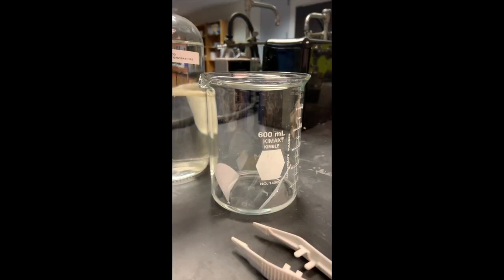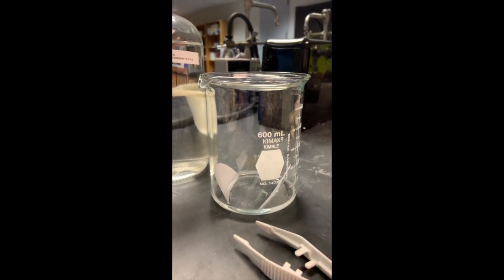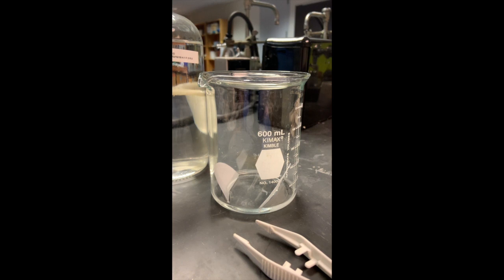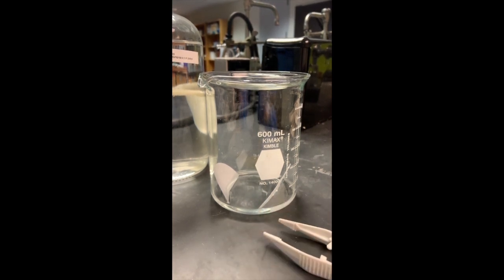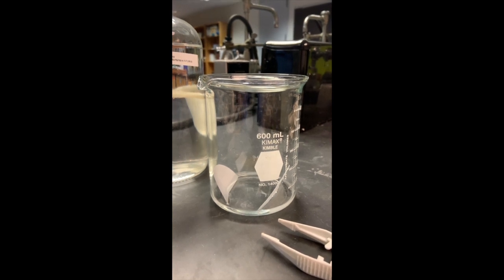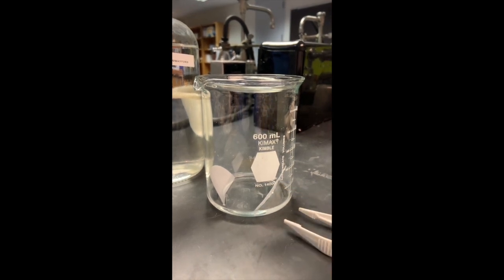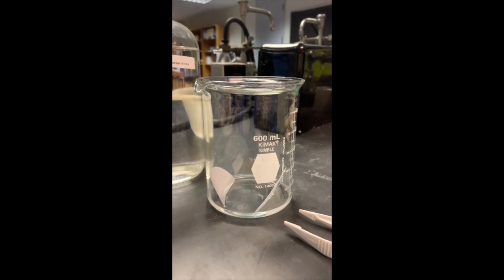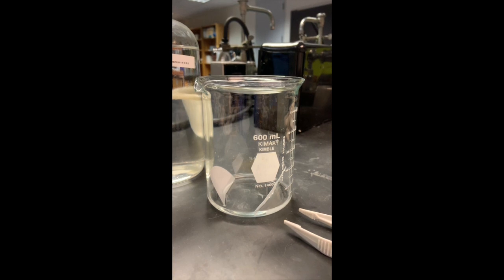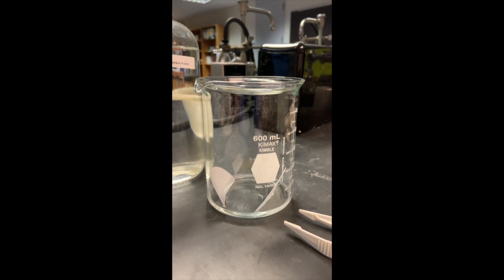This is my developing chamber. It's a beaker. There's a watch glass on top. I cut a piece of filter paper in half, and then I used these tweezers to submerge them into my 1% acetic acid in ethyl acetate, which is my developing solvent. And then I stood them up resting against the sides of the beaker so they can act as a wick and make the whole beaker filled with vapor of my 1% acetic acid and ethyl acetate.